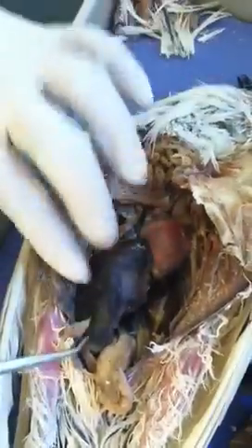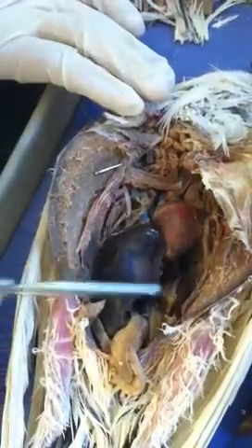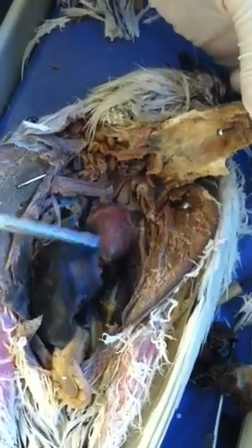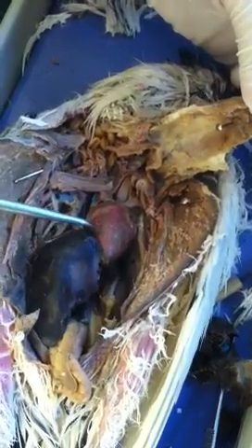Putting everything back, the largest organ you will see in birds is actually the liver — it has multiple lobes. Removing the keel, you will see the heart exposed. The heart has two atria, and if you cut it open you will see two ventricles.